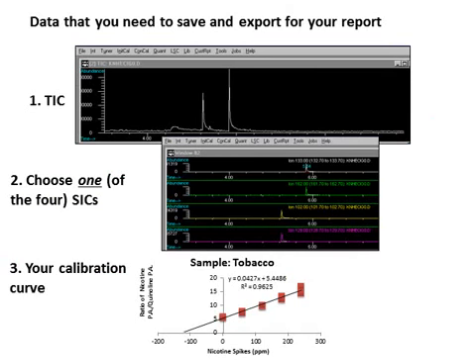Lastly, I'll end with a couple of recommendations for you. This lab tends to take up the entire 5-hour period, and so you need to be prepared and ready to go at the start of the lab. Because some of the components in your samples are volatile, keeping the sample on ice throughout the experiment tends to increase the reproducibility of the data.